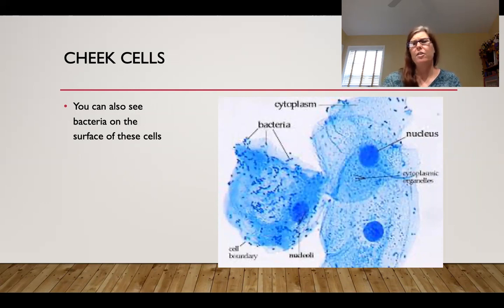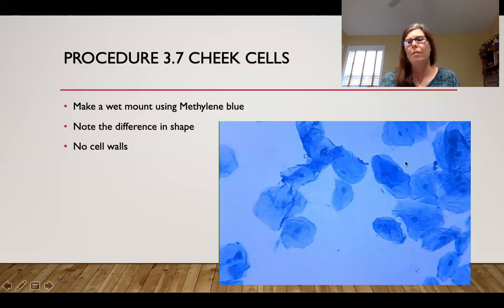Usually if we use a different stain like Janus green, we'll get a better picture of those mitochondria, but you kind of can see those organelles. There's something else inside that cell, and that's full of organelles. And so again, you're supposed to draw this. If we go back, this would probably be about the view you would get under your 40x, maybe a little bit bigger, maybe more of 100x. But you would be able to approximate the size.